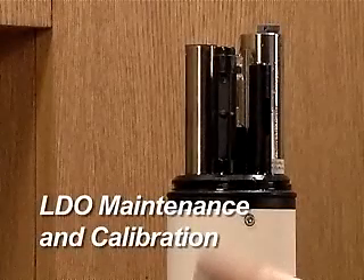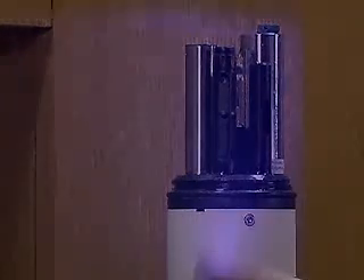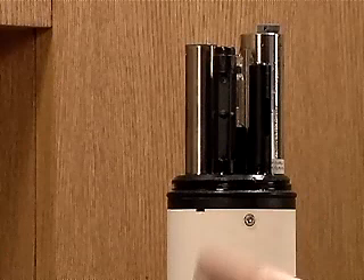LDO Maintenance and Calibration. The Hach LDO probe measures the oxygen dissolved in water by flashing a blue light on the sensor cap, coated with a luminescent material, and measuring the time it takes for the sensor to return red light. More oxygen in the water causes a shorter time delay.